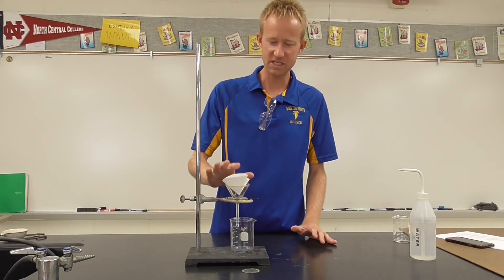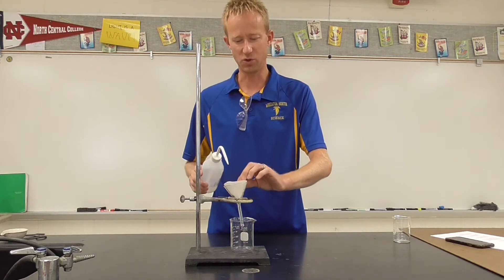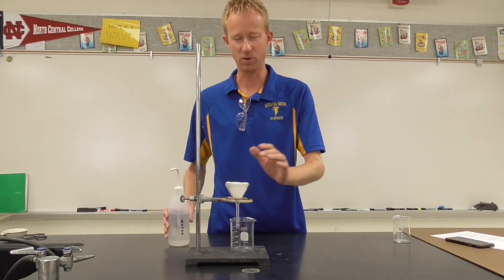Now you'll notice this doesn't seat itself very well into the funnel. So what you want to do is use your wash bottle to simply wet the filter paper a little bit.